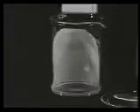Using the tweezers, place the TLC plate carefully into the tank, making sure that it is the correct way around with the baseline at the bottom, and allow the back of the plate to lean against the sides of the container at a slight angle. The baseline must be above the level of solvent in the bottom of the container.